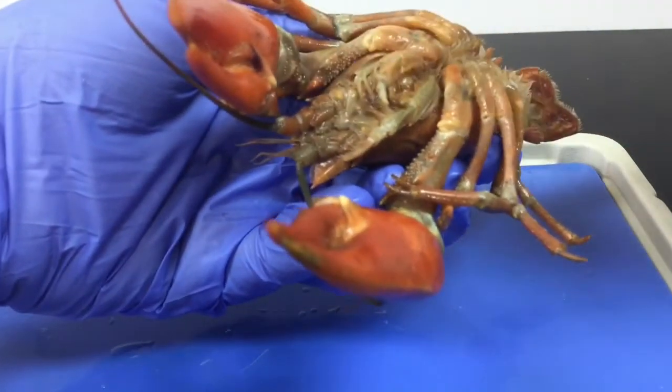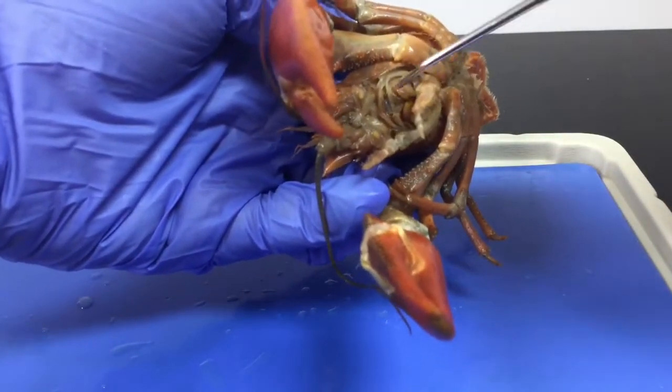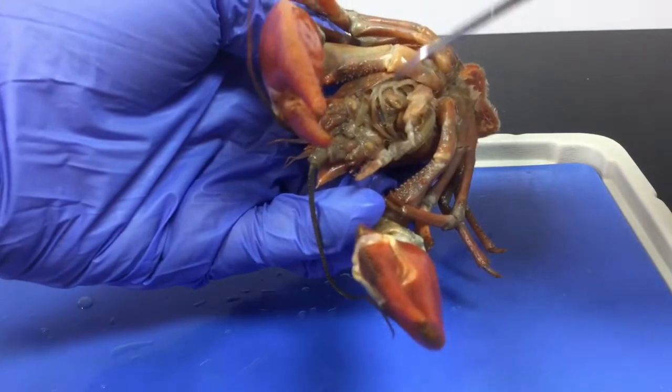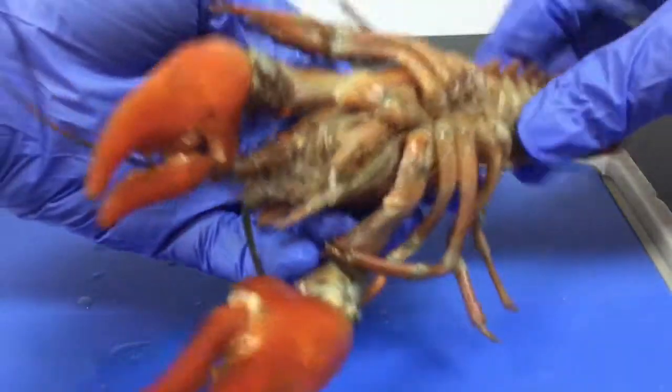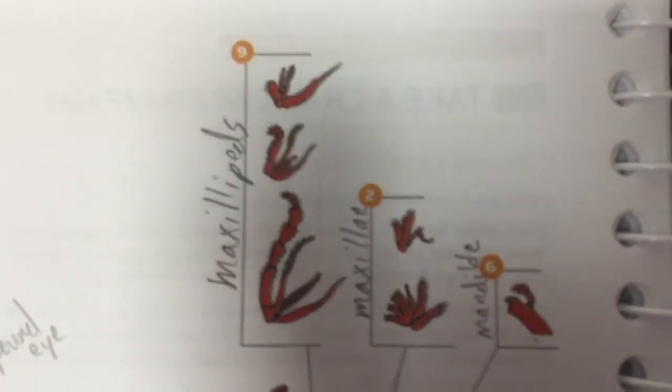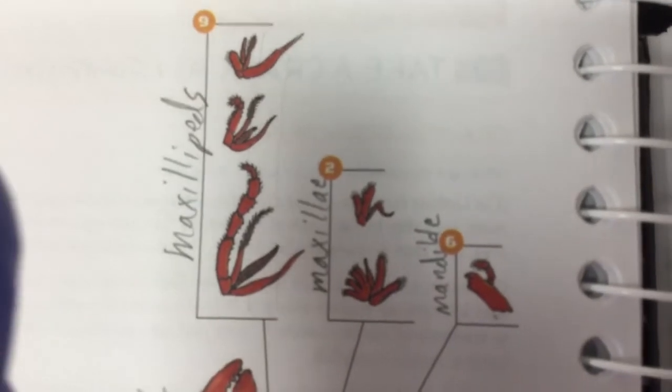And then underneath the maxillipeds are the maxilla, and then we go deeper and we'll find the mandibles, and they're actually very, very hard. Can you hear that? Feels like rock. So the picture in our book shows the maxillipeds, the maxilla, and the mandible. We're going to be taking these out so you can see them.